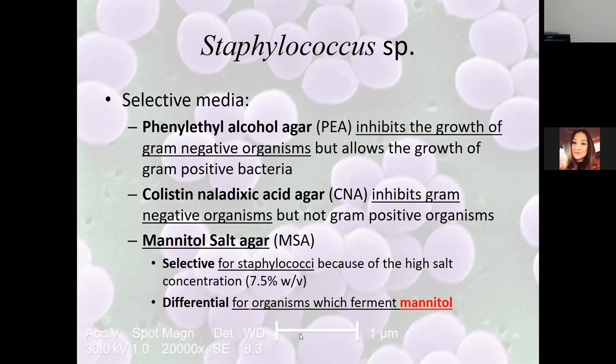So it's not a very good plate to say, oh, I think I have a gram-positive organism, because you may have a gram-negative organism, or you may have both, right? So we can use the other agars to differentiate. So it takes out the negatives. If I had a blood agar and I put a PEA up here and I looked at it, I go, well, the blood agar's growing and the PEA's growing, and it looks like the same pattern that I struck on both of them. Then that tells you probably got one organism, right?